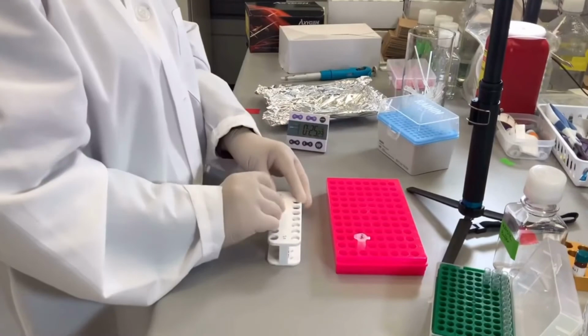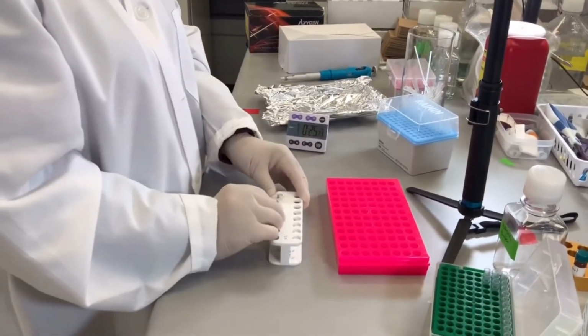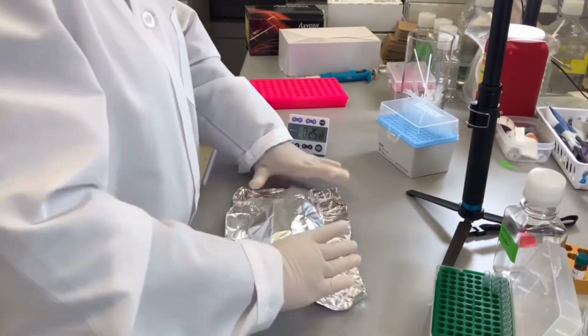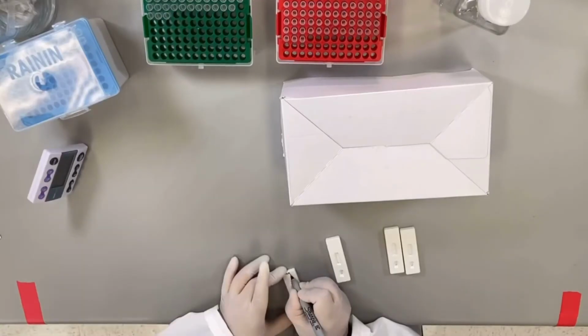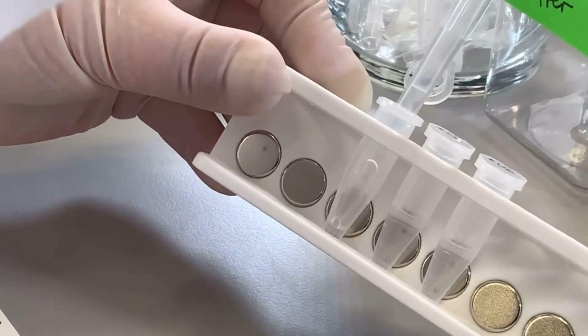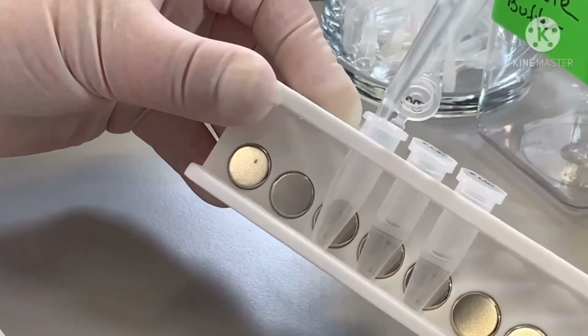Place the vial on a magnetic rack for 30 minutes, protected from light. The nanoparticles will accumulate against the wall of the vial, but this time it may not be as obvious as with the positive and negative control. Open and label the cassettes. After 30 minutes on the magnetic rack, remove the liquid gently, placing the pipette tip close to the wall opposite the magnets to not disturb the particles.